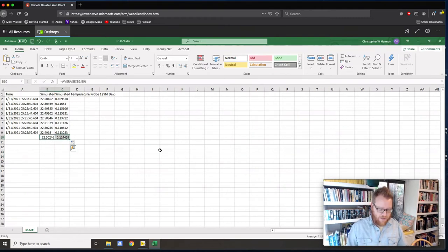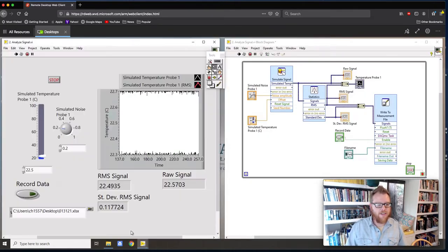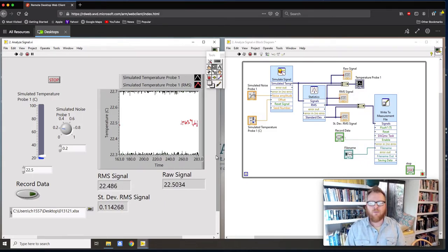And so now I'm going to go ahead and just delete this so that I can keep writing on top of this Excel file. And I'm going to close it. I'm not going to save it. So I still got it on the desktop there. And what's pretty cool here is you can see that my LabVIEW program is still running. It's definitely not happy with me, like it didn't show me any of those data points because I'm screen recording and doing this over the internet, so I'm using a lot of computer resources. So in the lab, I expect that these programs will run with lightning speed capabilities, okay?